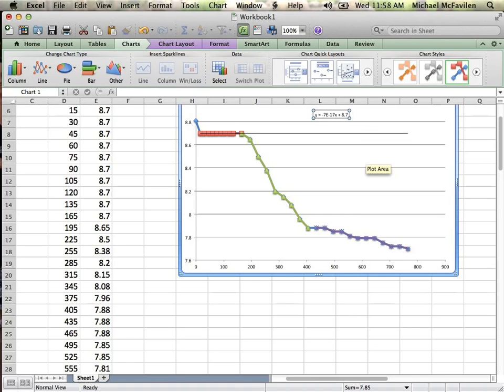That depends on the data set. I decided to not include her 0 point because I see a substantial change in the volume there. So to me, what that is, is that when they added the sulfuric acid to their reaction, the sulfuric acid still had a little bit of heat to it, which caused the ice to melt right away. It then stabilized. It's up to you. If you see that it looks nice and it looks kind of smooth as a straight line and it's angled downwards, that's fine. If you don't see it, then don't worry about it. You kind of have to evaluate per data set to decide.